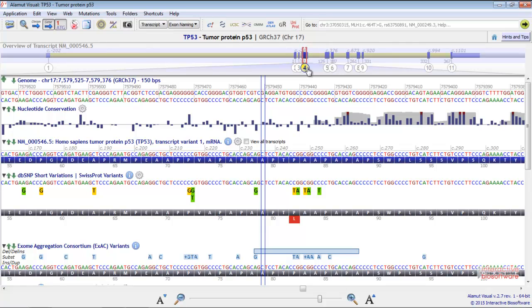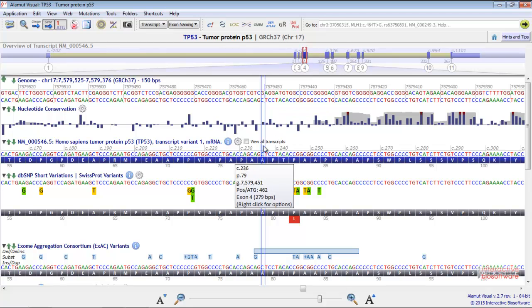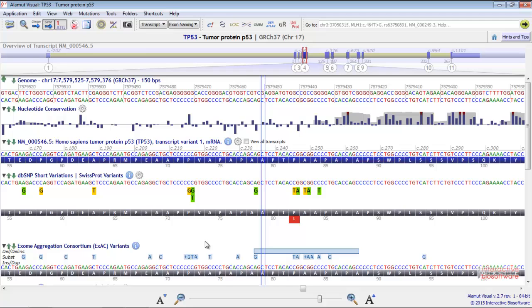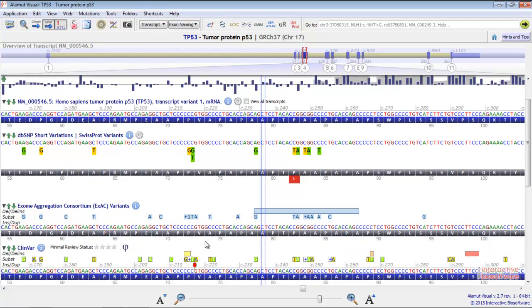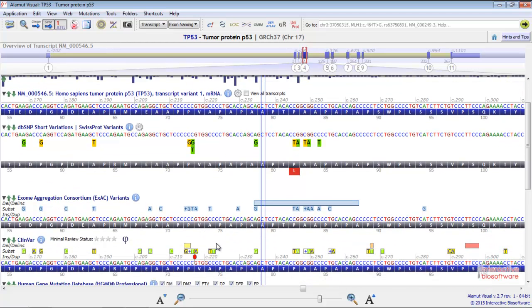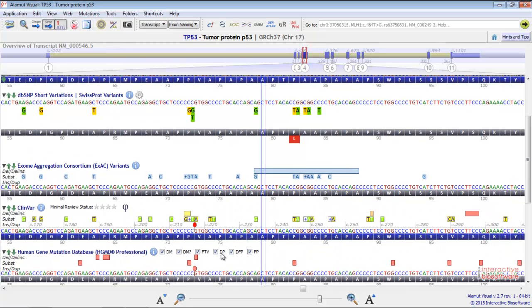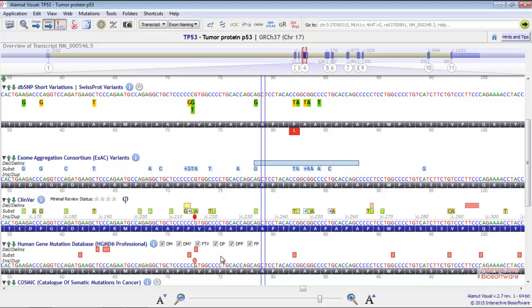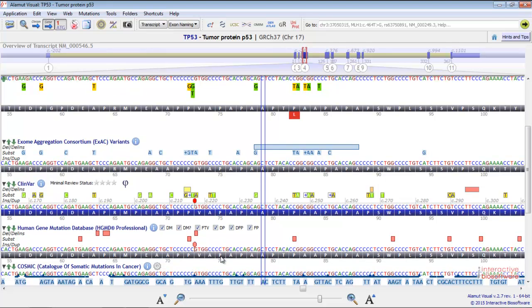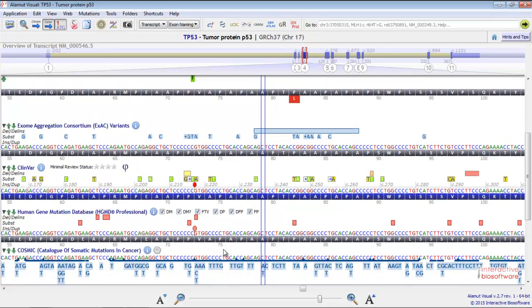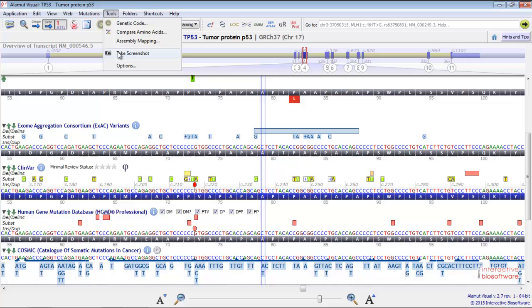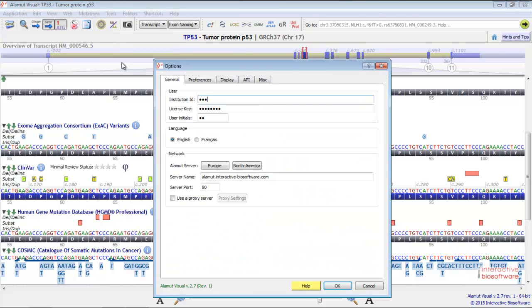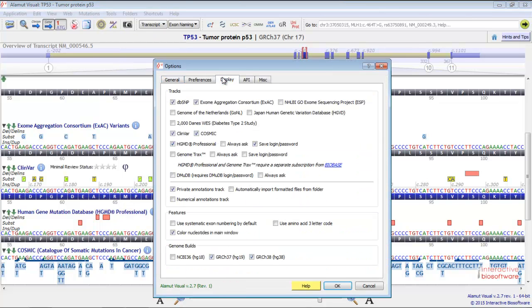You have different tracks coming from different reliable sources such as dbSNP and SwissProt, ExAC, ClinVar, HGMD and COSMIC. In the options window, you can display the tracks you want. Just go to the menu Tools, Options, Display.